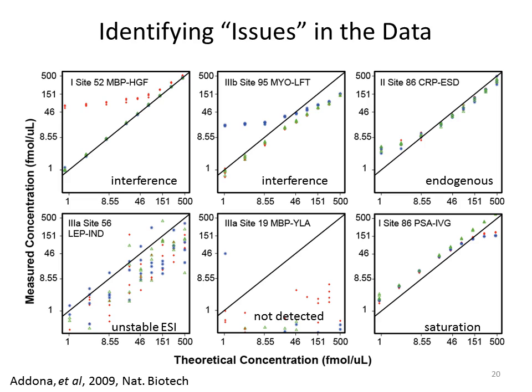Yes? Hi, I have a question. What instrument was it detected on? And would we see oversaturation on all kinds of instruments? Oh, this was a Q-trap. Yep. So saturation can be detected on a triple quad because ions are being collected in a beam-like fashion.